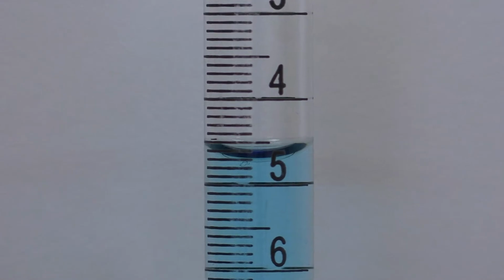Get it up pretty close to the first trial. You'll have a better idea of your volume after the first trial. You'll waste time getting it exactly to zero. By this time in your educational career, you should be able to handle simple subtraction.